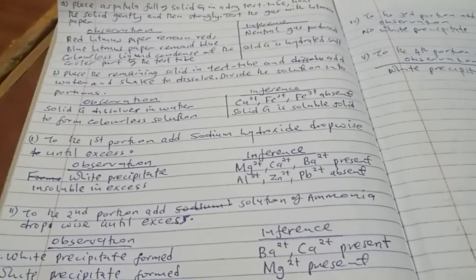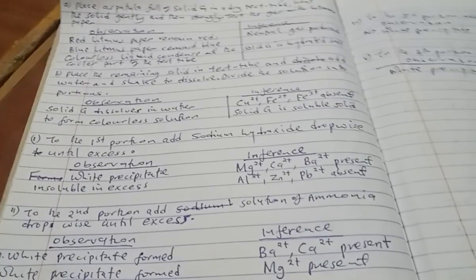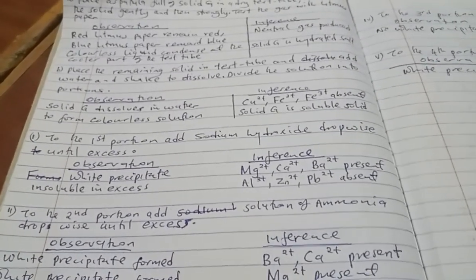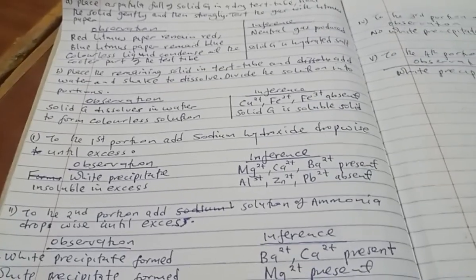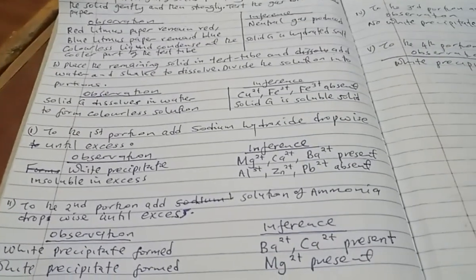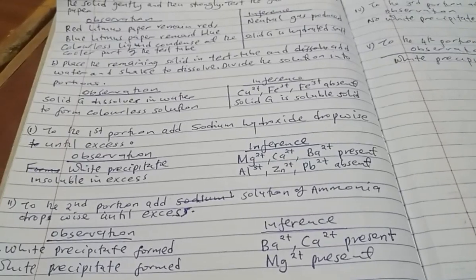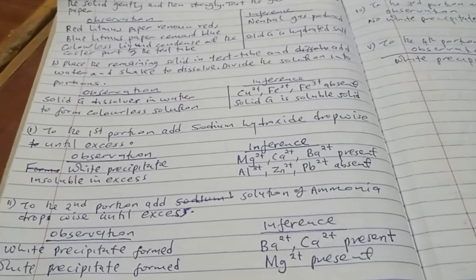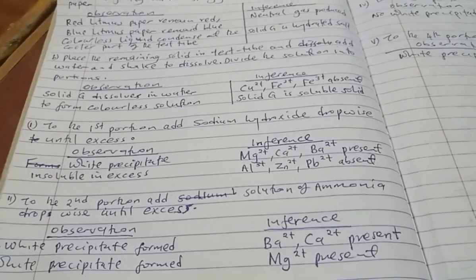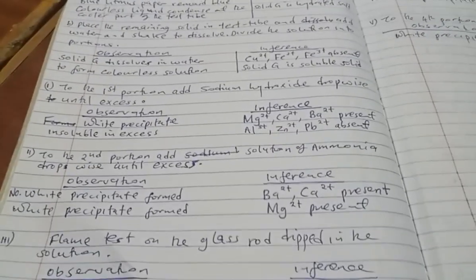Then to the first portion of the solution, you are required to add sodium hydroxide dropwise. So when we are adding sodium hydroxide dropwise, then we expect white precipitate soluble or white precipitate insoluble. In this case, I've given an example where the observation is white precipitate insoluble in excess, then under inference, you tell us magnesium, calcium, barium present.